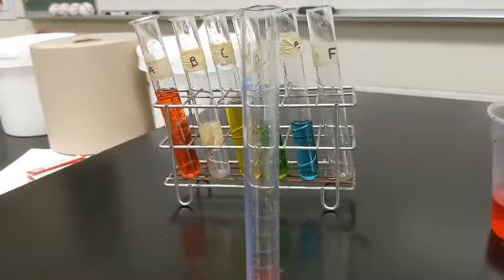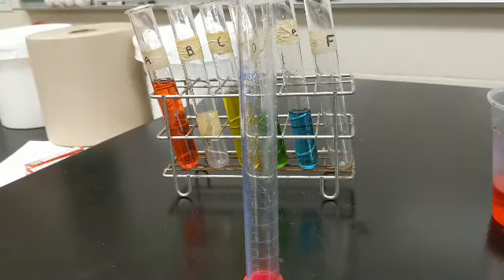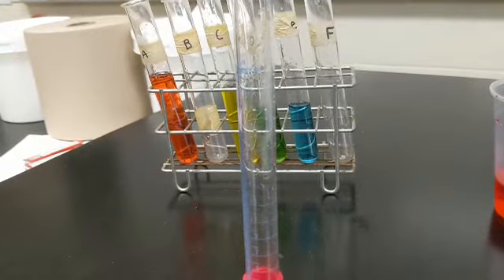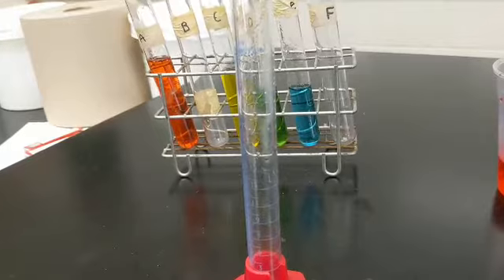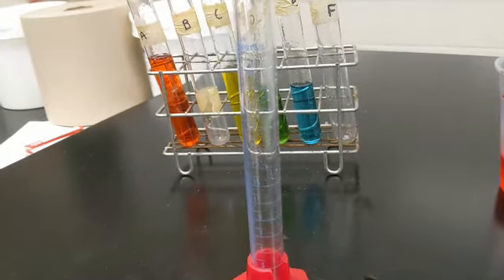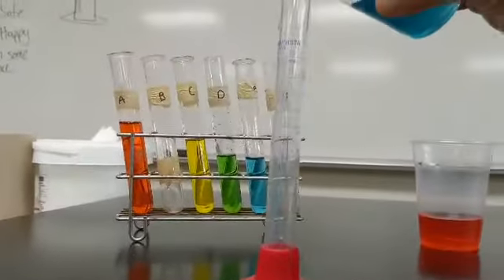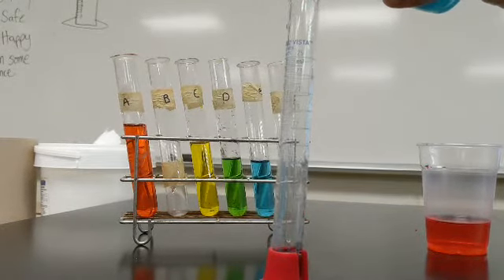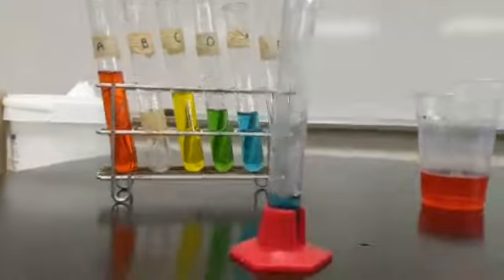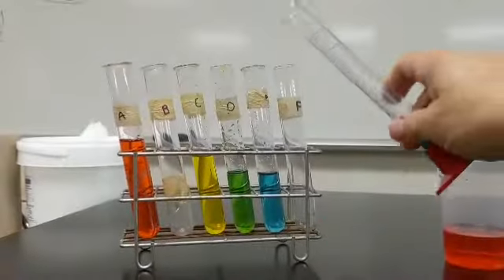All right, so the next step is step 7. From the beaker of, I'm sorry, we're on step 6. From the beaker of blue water, measure 4 milliliters and pour it into test tube F. Now the beakers are referring to these cups of water, okay? Four milliliters. Boom, right there. I nailed it. And pour it into F.